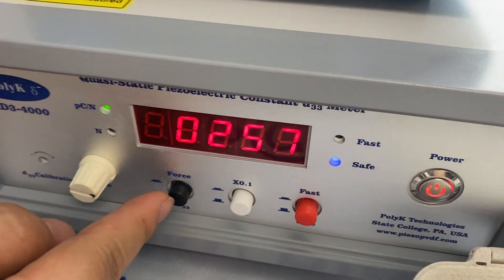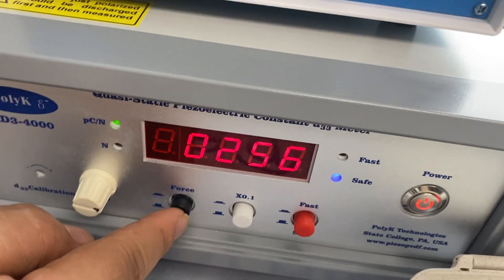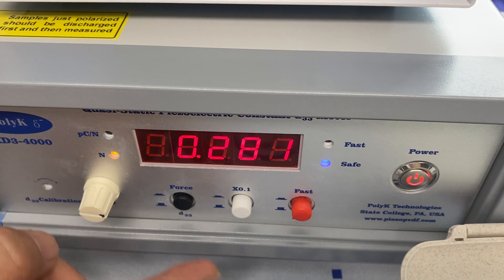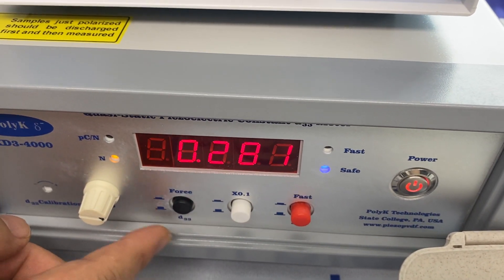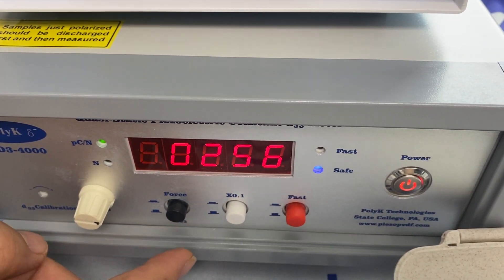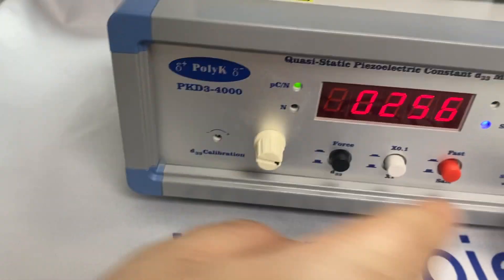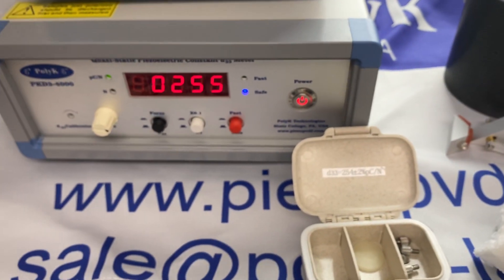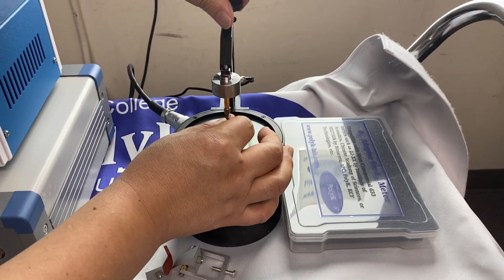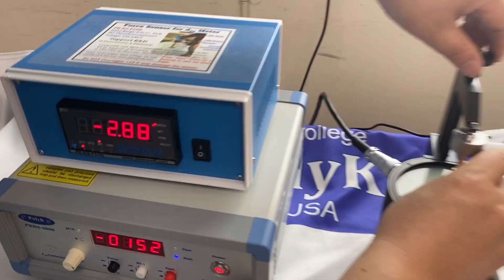When I push the button, it shows the dynamic force — that's about 257 millinewton. When I hold it down, it shows the static force, about 0.28 newton. When I release, it shows the D33 value, which is about 256. If you want to do calibration, use a small screwdriver to adjust it to exactly 254. Here it's close enough, so I don't have to. Now I switch the calibration standard orientation — it should become negative, and the positive and negative values should be the same.